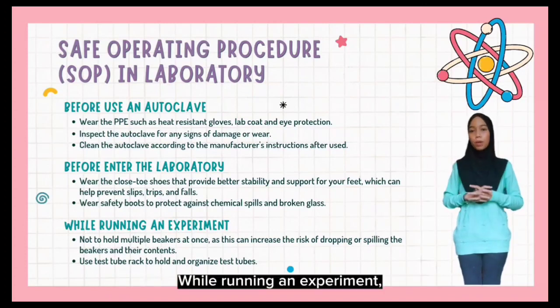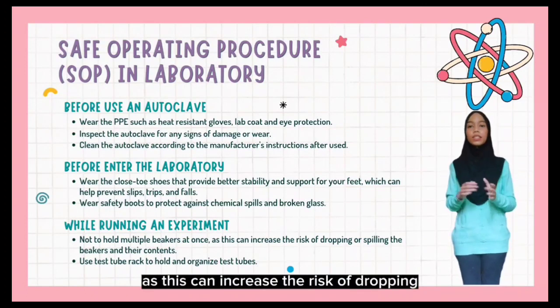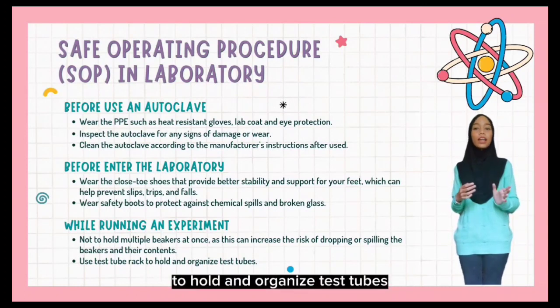When running an experiment, do not hold multiple beakers at once, as this can increase the risk of dropping or spilling the beakers and their contents. We can use a test tube rack to hold and organize test tubes.